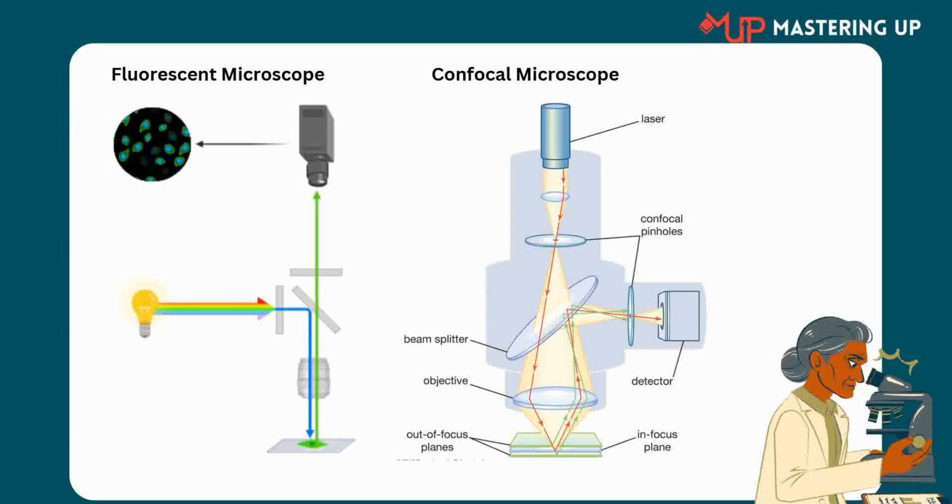Fluorescent microscopes are used in multiple fields to gather images of smaller specimens, such as cells. The technique is that samples are treated with fluorophores so that they re-emit light after being excited by a light source. We can then use the light source to reflect light at the desired emission and excitation wavelength. As a result, we can obtain a high resolution image.